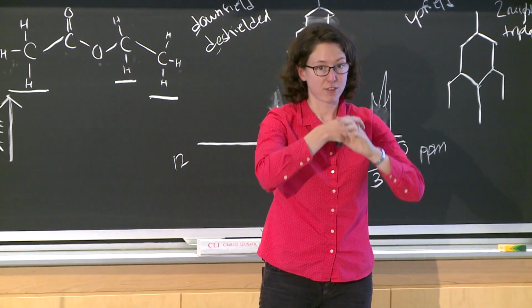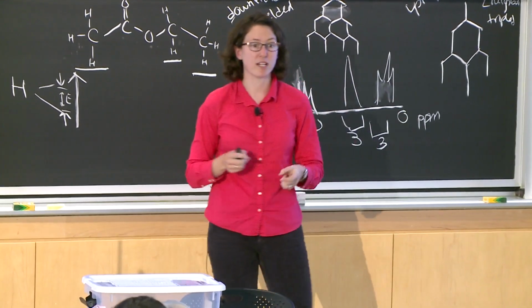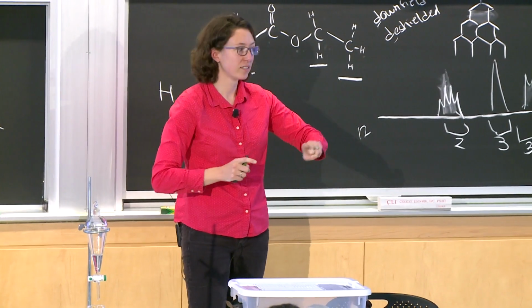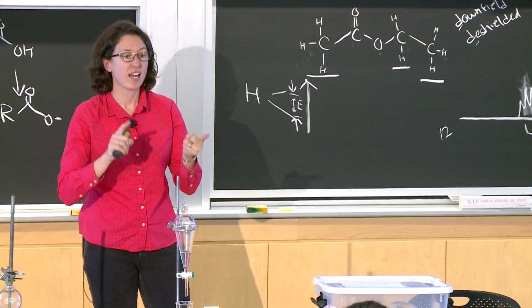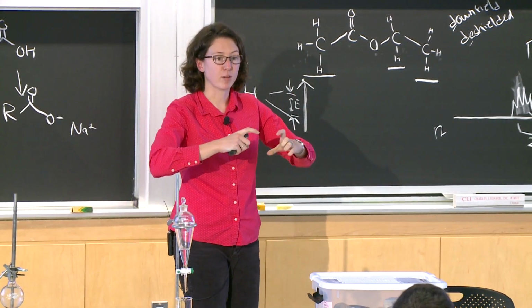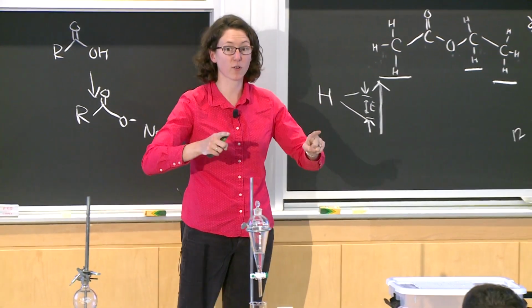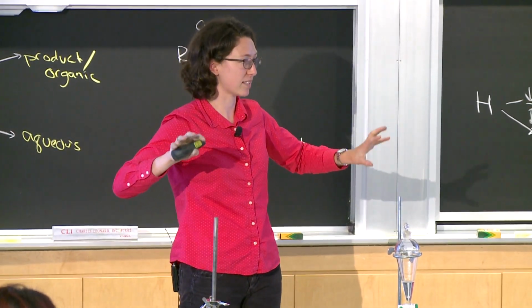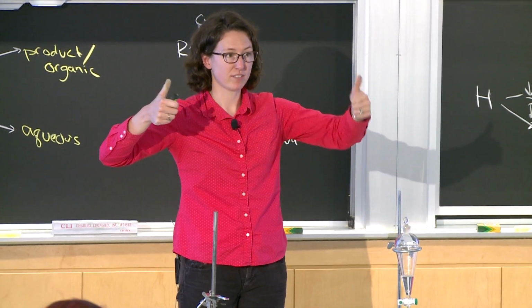There will be 3 different sets of waste containers out there, and we do not want to mix in between, especially not acetone with the catalase waste. If you remember from before, we may have talked about this. You will hear about it again. If you mix the acetone from any of these organic labs with the hydrogen peroxide from the catalase waste, you will generate explosives. So we are not going to do that because everybody's going to read the waste labels and dispose of their waste properly in this lab and keep everything in the hood that should be. Good? Excellent.